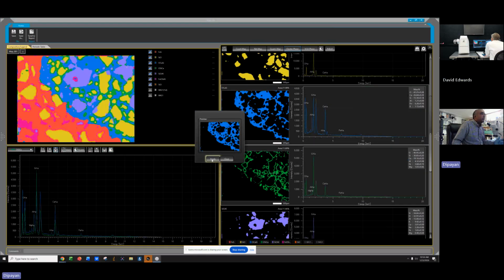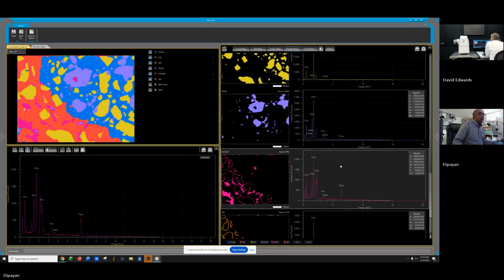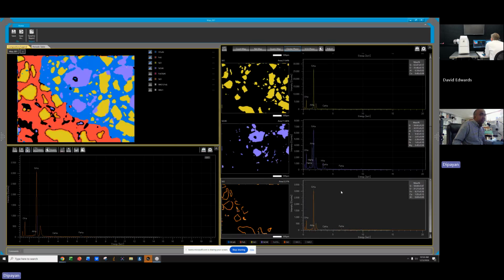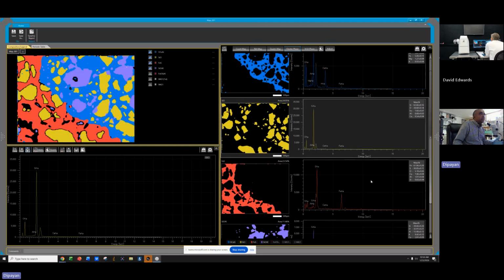I can mix those two. But this is another margin. This is basically iron, there is no phase of iron silica alumina. This is no phase, just a transition. So I'll just close that. This is the same thing, but this can be combined with quartz. I can combine those. But where is the main separation that I was looking for?